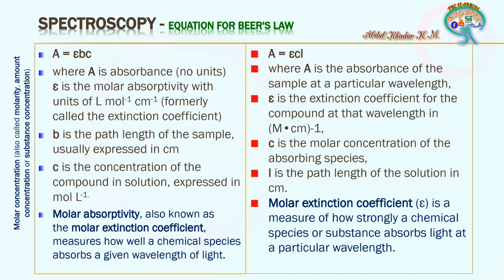So here, under the overall electromagnetic spectrum, which has different wavelengths, we cannot measure the absorbance at any wavelength we like in nanometers. So it is said that a particular wavelength will be the molar absorptivity wavelength. That wavelength acts as the reference for the estimation of the absorbance of any compound.